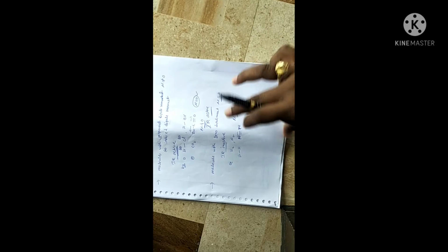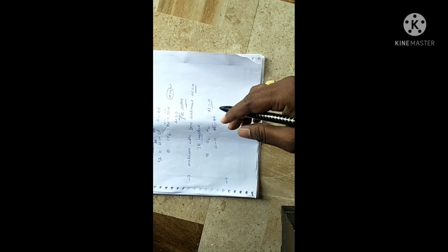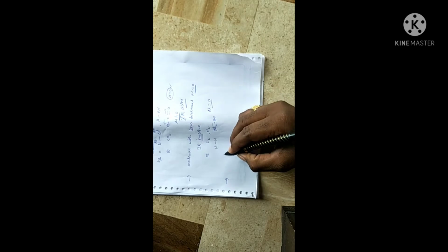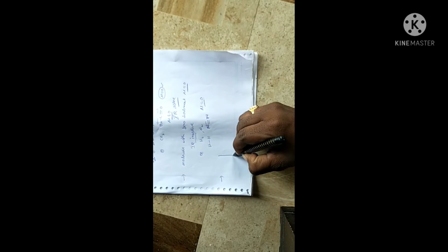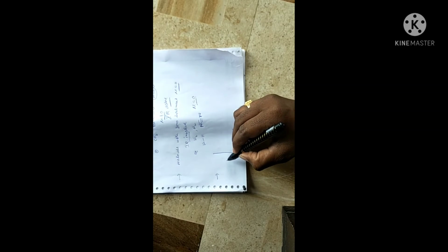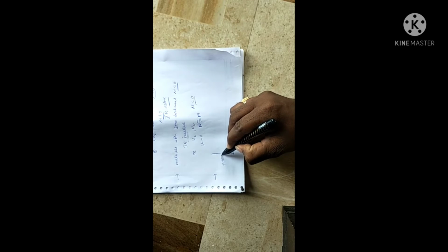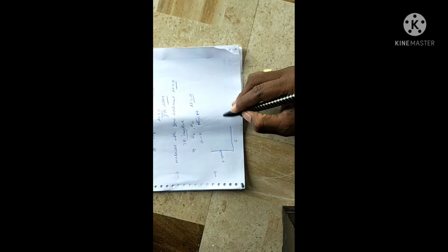And this is an IR spectrum. This IR spectrum is a two-dimensional spectrum, and in this, on the y-axis we are taking the percentage of transmission, and this is the wave number.